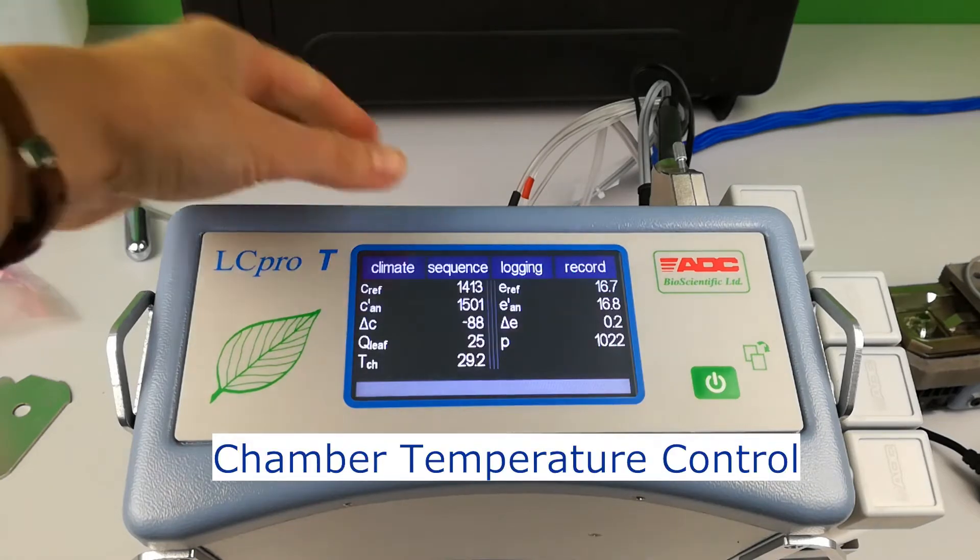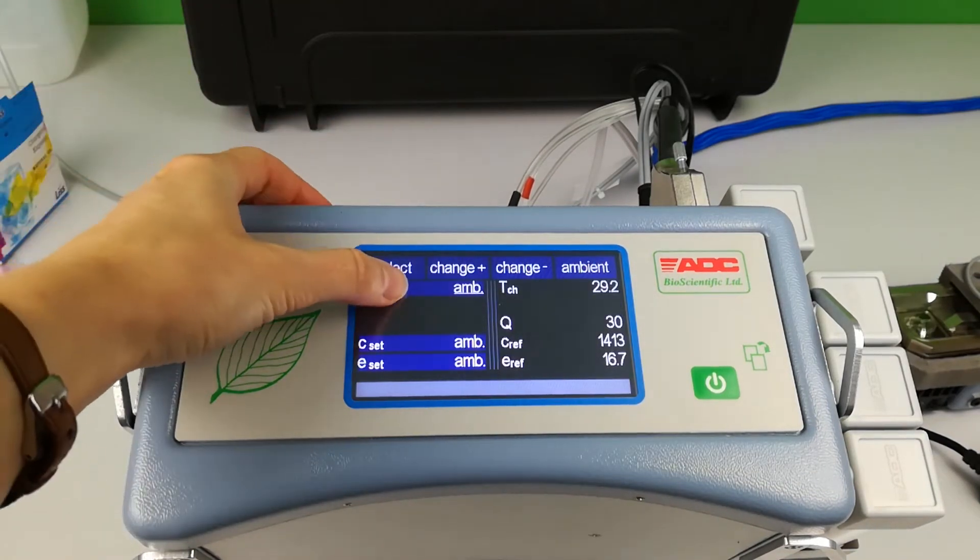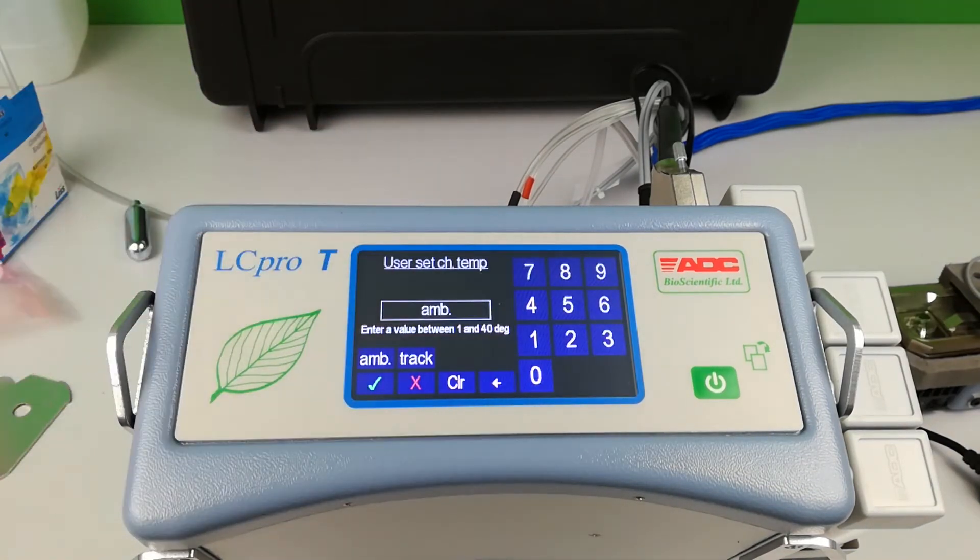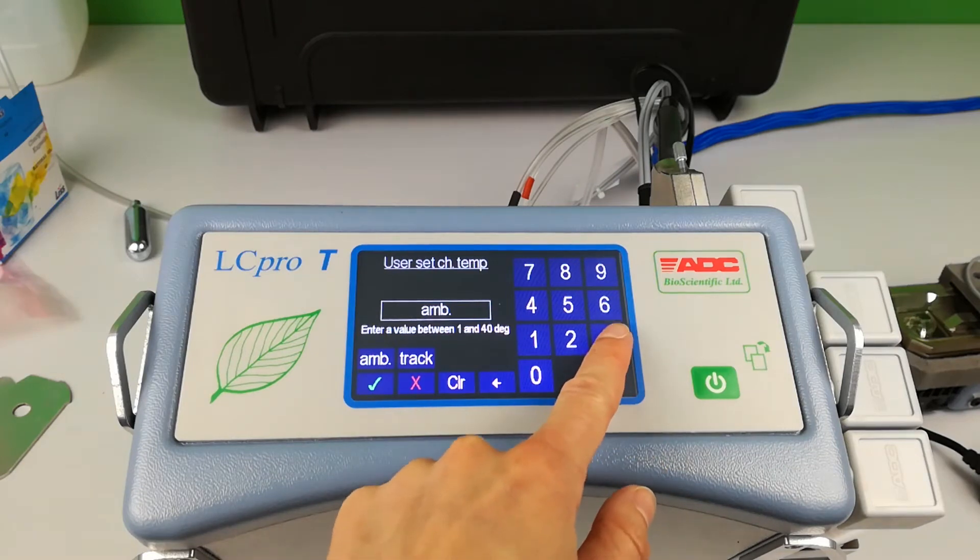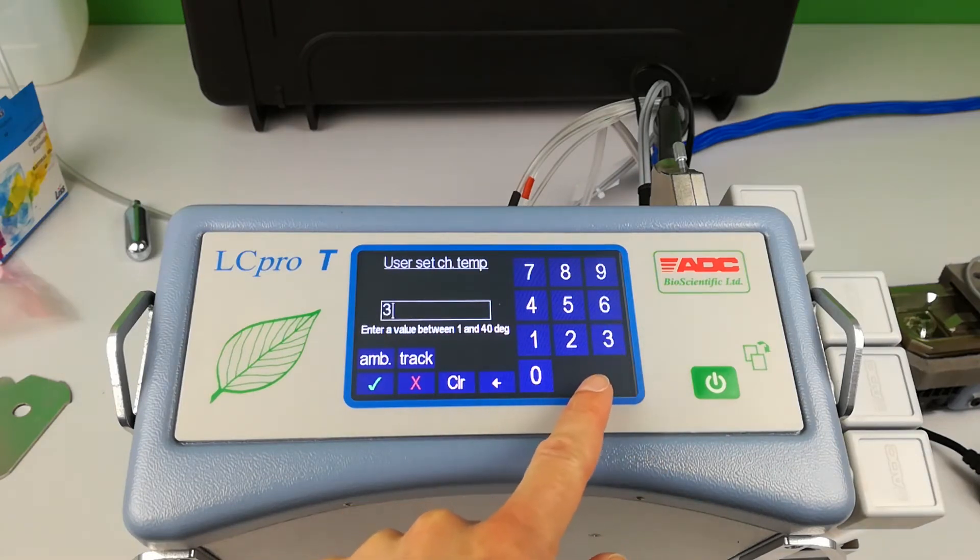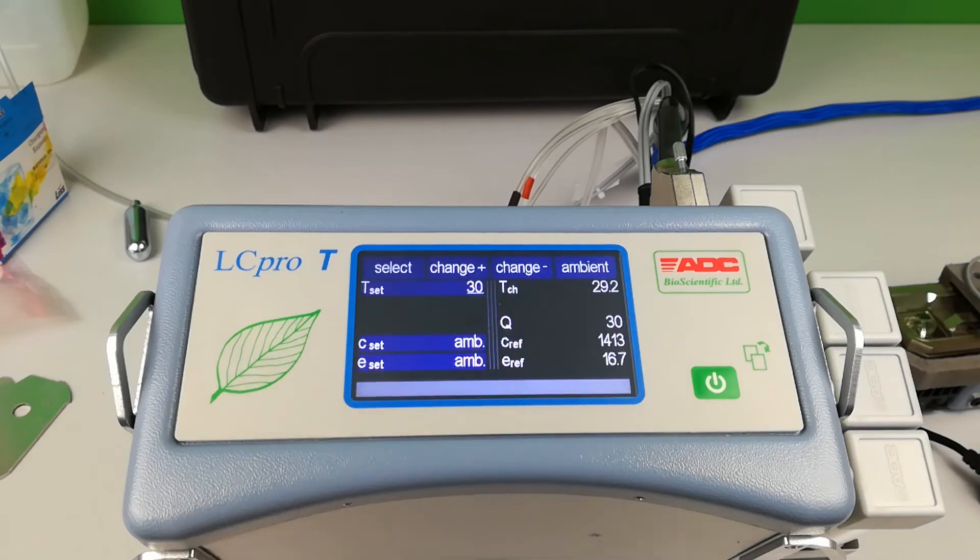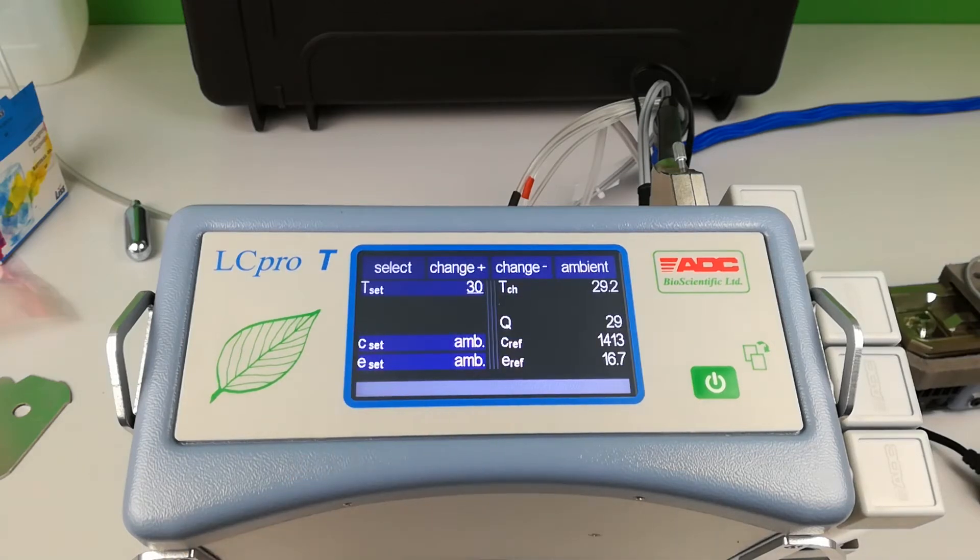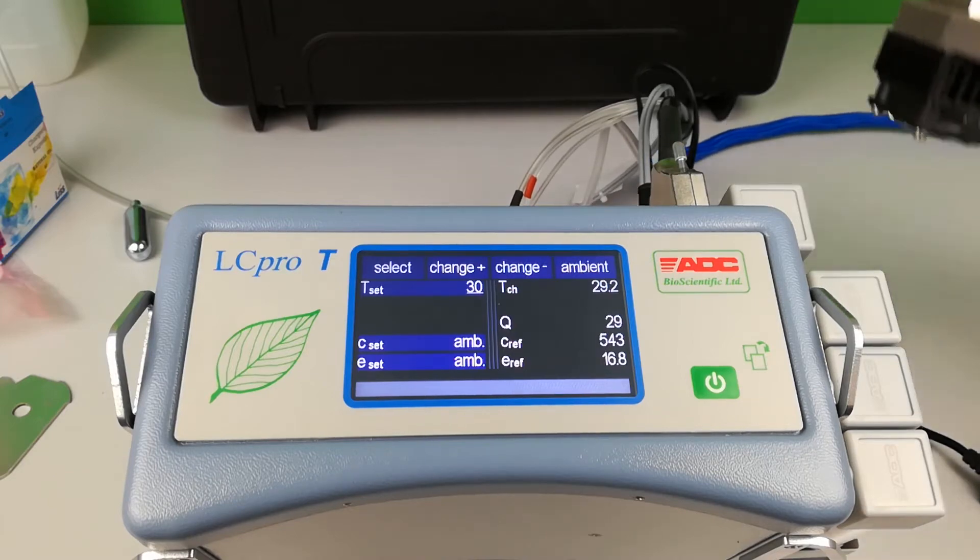Chamber temperature control. Enter climate. T set at the top. The default setting is ambient. Begin to enter a value and use the green arrow to confirm the change. Here the chamber temperature is now set to 30 degrees.